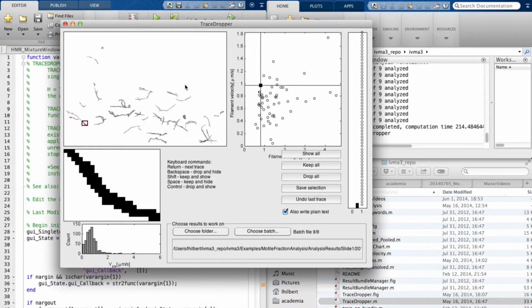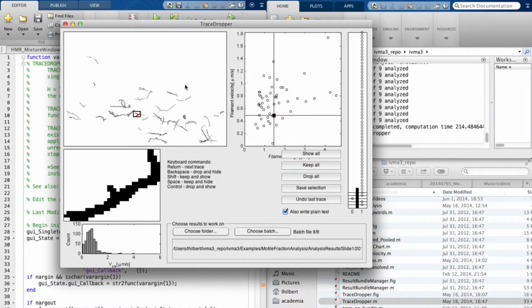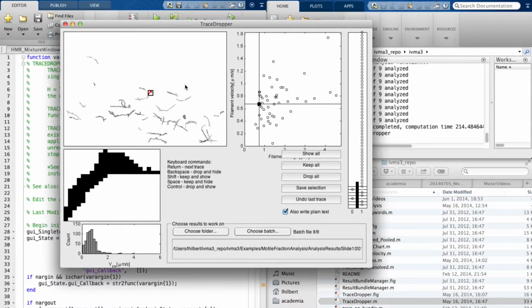And I think we're in the last slide to take care of here. So not far to go anymore.